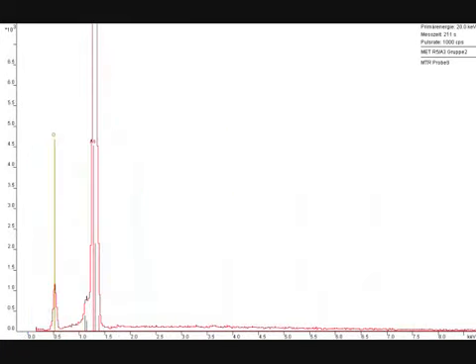Now the next graph will be quite the opposite of that. You can see just one very well-defined peak from arsenic and from oxygen. That was to be expected because it was actually a sample of genuine arsenic. Arsenic occurs pure in mineral form sometimes, in this case it does. And it is covered with a layer of oxygen, which is very typical.